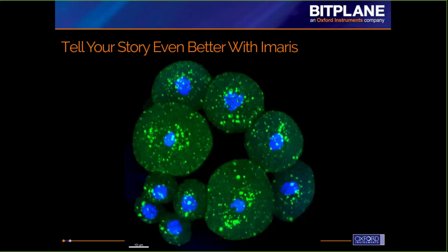And so, for example, we have an image here. This is of a sea urchin embryo. We see some of the cells from it. We see that there is a green label here that is punctate, but also somewhat cytoplasmic, so we can make out the cells. We also have a nuclear label, and so you see that in blue. And you can imagine that for this data set, you might want to know where are those puncta in relation to the nucleus or in relation to the edge of the cell. And so performing that type of analysis is something that we wanted to go after as part of this release.